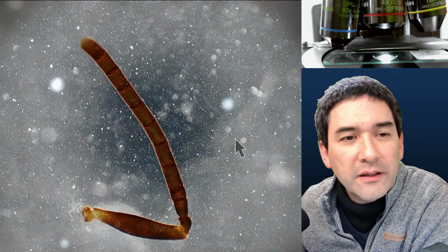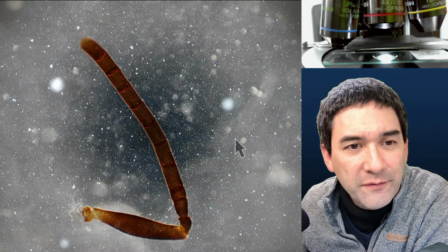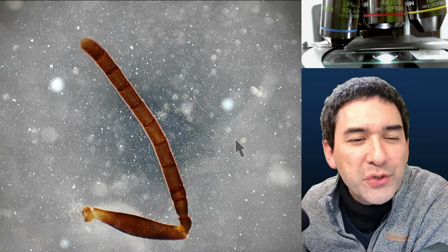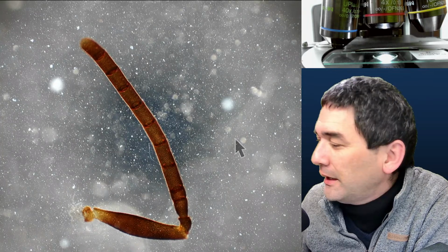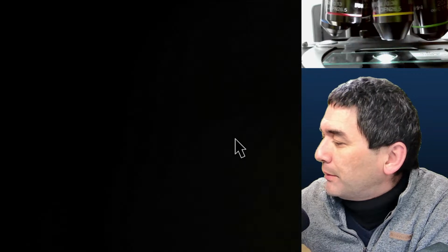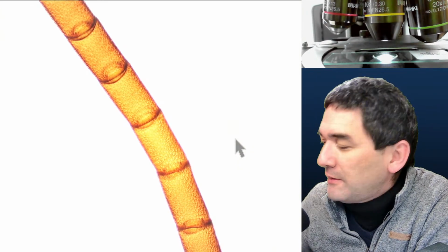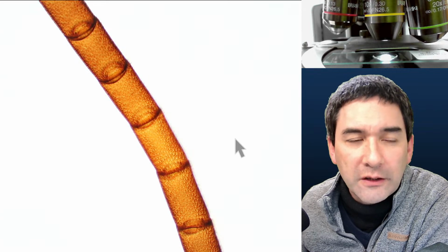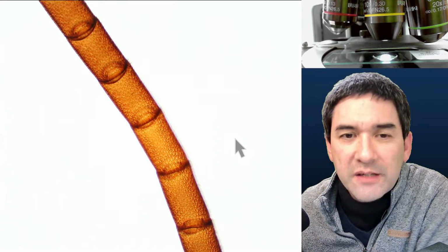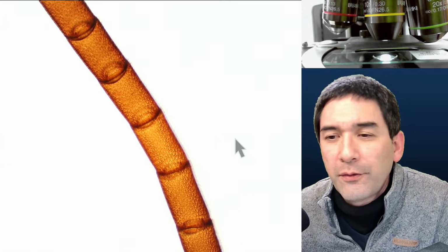Yeah, it's not working so well here. This is actually my phase contrast filter, which I'm abusing also for dark field. Okay, but I'm not using this very often. But what you can do is you can essentially easily make your own dark field filter. What I have got is on this microscope I can improvise a little bit of dark field, but actually it's the filter for phase contrast.